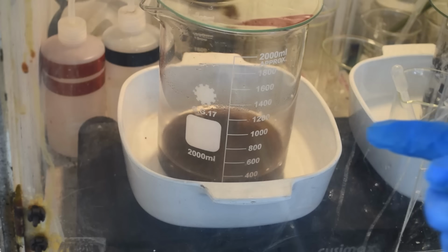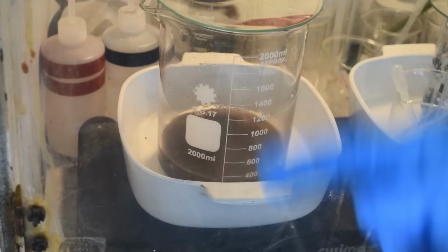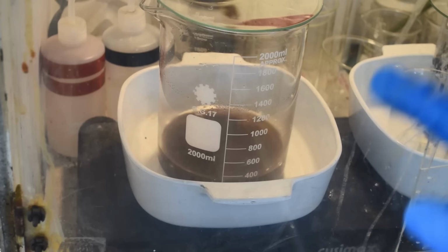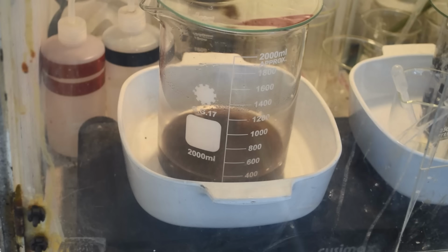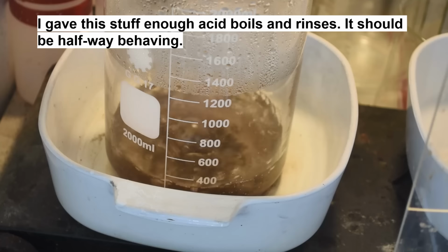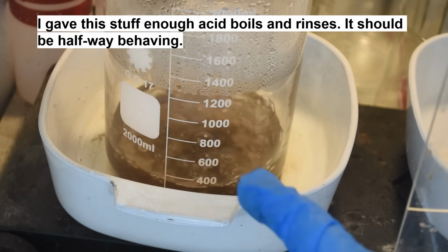and if that works, if it's agglomerating nice, well, we can decant off this first water and maybe give it a boil in hydrochloric acid and then a couple more distilled water boils to clean up the gold. So that's my plan. We'll see if it works. This stuff may not play nice. Let's see what happens. All right, well, surprisingly, or maybe not surprisingly, the gold seems to be behaving itself.